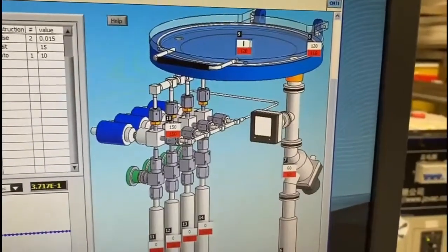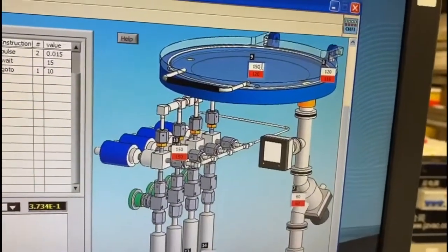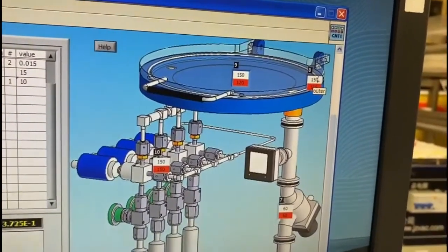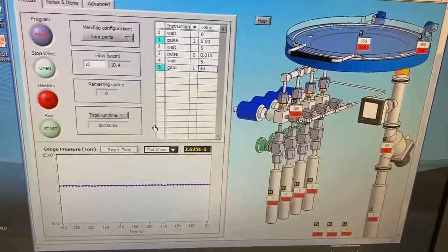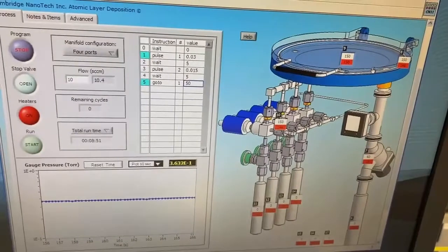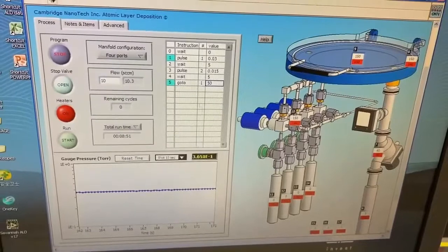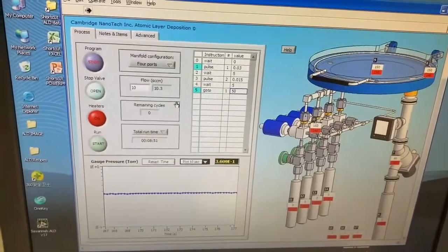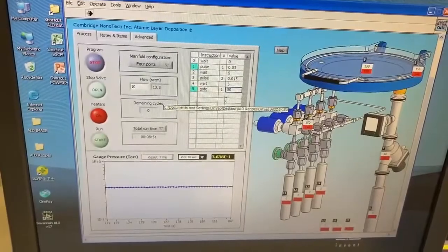At the same time, the deposition temperature in the chamber can be set according to your recipe. You should make sure all the heaters are set to the designed temperatures before deposition, and also check that the gauge pressure is less than 0.5 torr and the value is stable for several minutes. And also confirm that your recipe has been loaded from the corresponding folder.